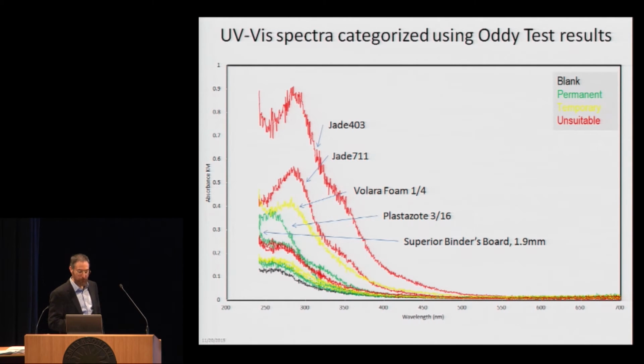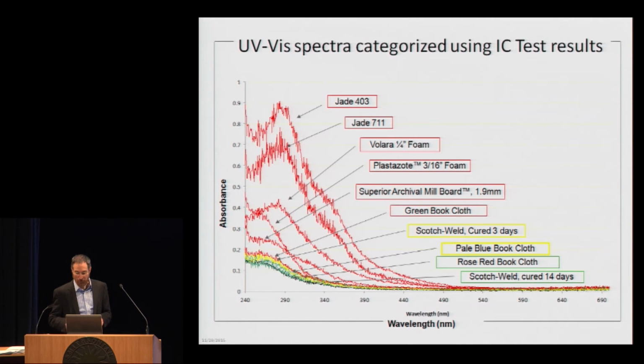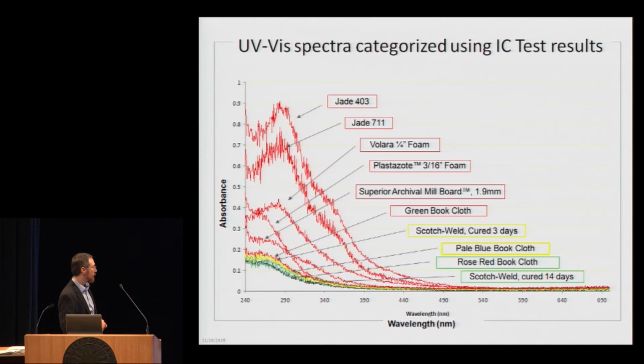And you would look at this and say, well, there's really no correlation. We can't use UV vis. And I agree, there's no correlation. You don't see all the green clumping together or all the red clumping together. But when I did this with the IC test and used those same curves and made the same color referencing on the chart, you can see that there's a much better correlation where the green ones are down near this black curve. The black curve is just our control. And then the yellow curves are slightly above that.